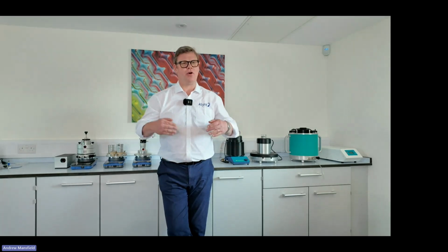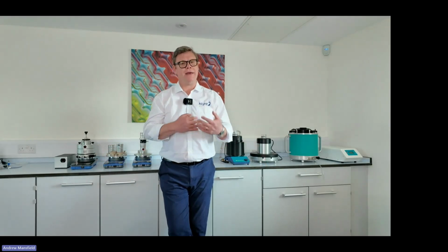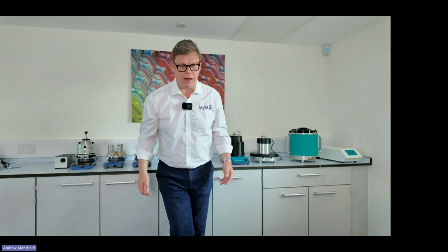Today we're going to be giving a brief introduction into photochemistry and really going to focus on how modern equipment, modern photochemistry apparatus, has made the area of photochemistry a lot more efficient and a lot more accessible to chemists in modern laboratories. So it should be running about 35-40 minutes or so.